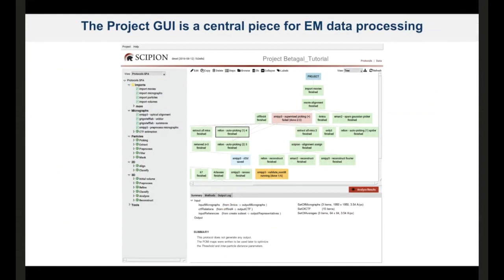In the right upper panel, you see the whole history of all the processing. This is a tree view, but you can also have a list or a shorter view. You can collapse many of these nodes, and then it's really easy to track all the processing that has been done and all the parameters, and follow different branches. It's also very easy to copy branches, or this whole workflow can be exported to a template. It's a text file, a JSON file, and this can be imported or shared with colleagues or with students. And it's very easy to have this template and start a new project with a different sample and repeat some of the steps.